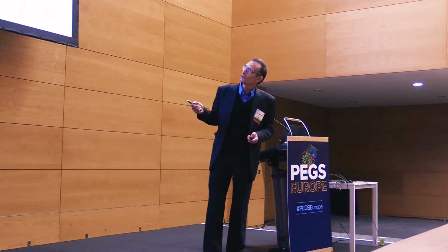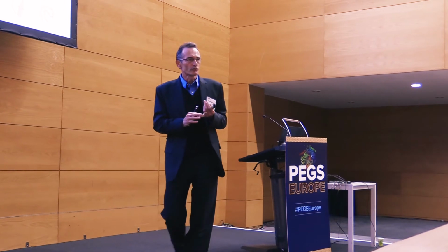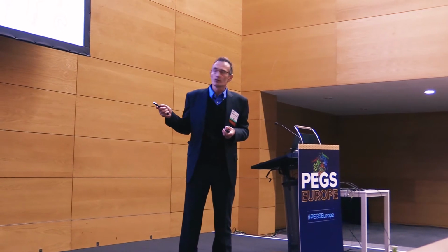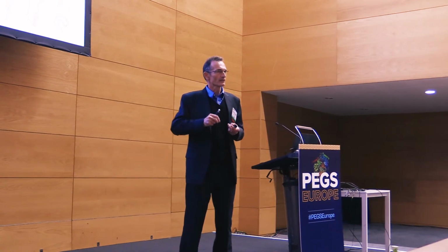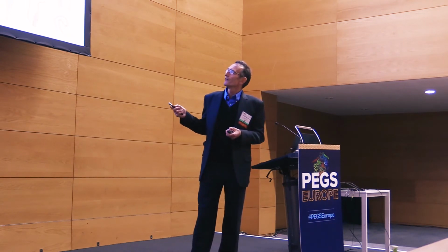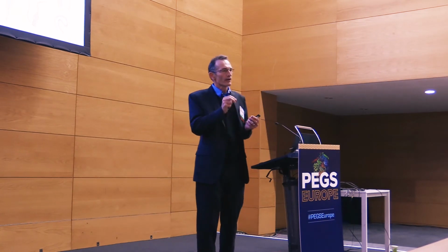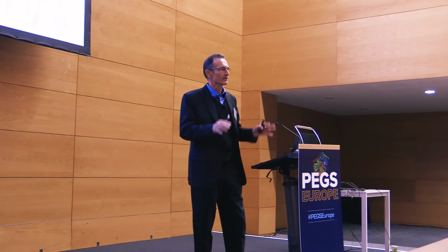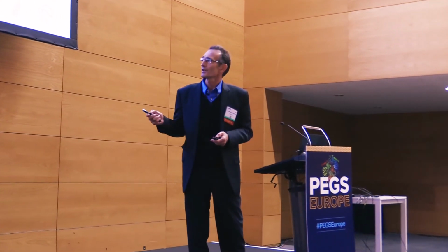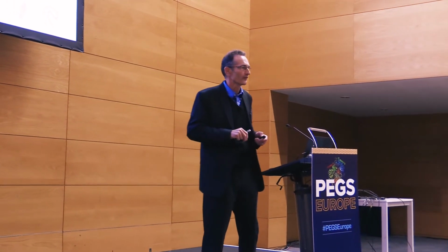Now, comparing the two sorts of diversity, the CDR1 and 2 diversity, this is germline, and this is true for both light chain and heavy chain. And in these, germline sequences dominate enormously over mutated sequences. And even within the somatically hypermutated sequences, you see a power distribution, which means that there are a few sequences that are found very frequently and a very large number of sequences that are only found once or twice. The diversity of CDR1 and 2 is compatible with oligonucleotide synthesis in arrays.